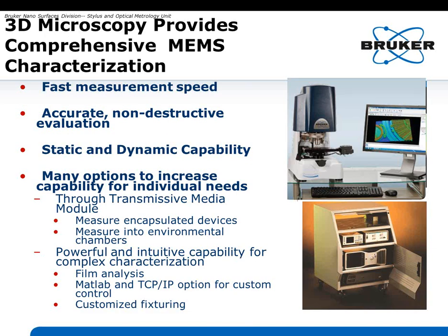So that's about the end of my talk here today. I just wanted to summarize that, in our experience, 3D microscopy really provides very comprehensive MEMS characterization. It's a nice combination of fast measurement speed and extremely high accuracy. It's non-contact and non-destructive, and it provides both static and dynamic capability.